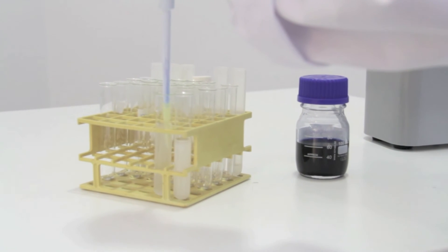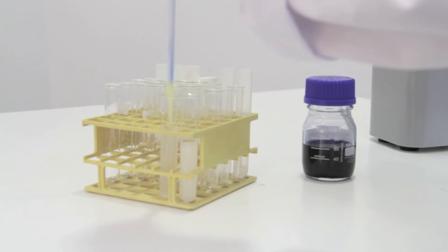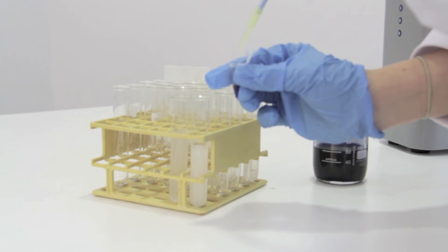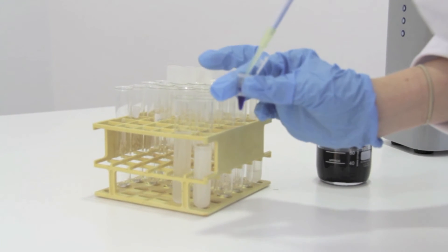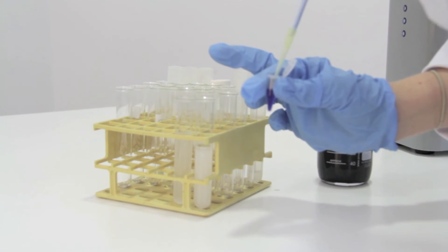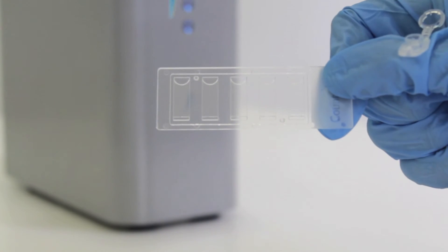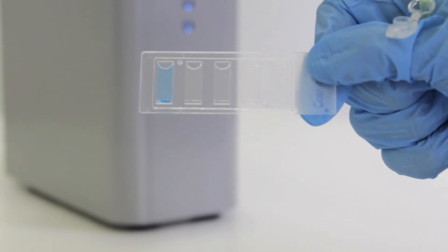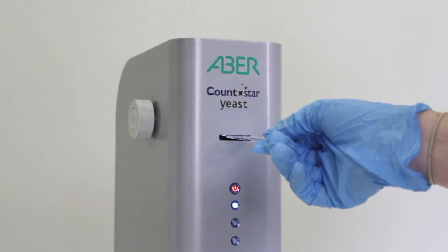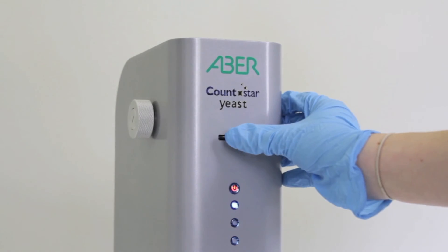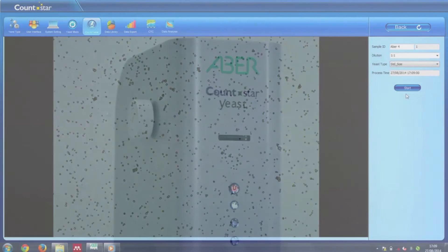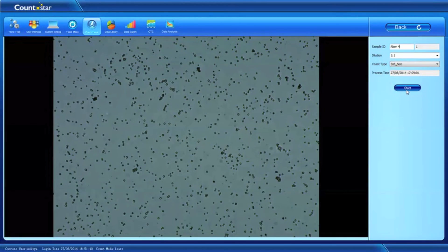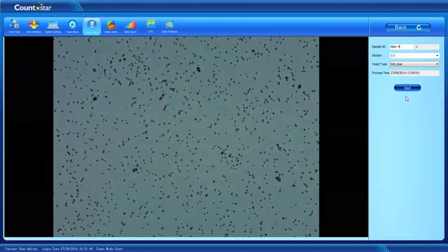For analysis, all the user needs to do is dilute the sample, stain it using the appropriate stain, pipette 20 microlitres of sample into one chamber of the CountStar slide, insert the slide into the slide port, and press start in the software. In less than 20 seconds, the CountStar analyses the sample for a variety of parameters.